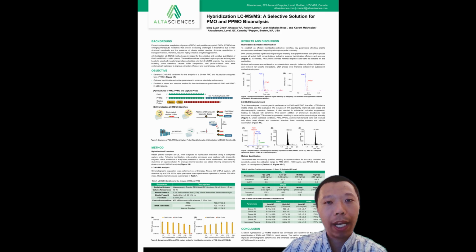PMO and the peptide-conjugated PMO, known as PPMO, are emerging therapeutic approaches. To support PK evaluation, sensitive and selective bioanalytical methods are essential. However, unlike conventional oligonucleotides, which are highly negatively charged, PMO is charge neutral, while PPMO contains a peptide conjugate that can introduce positive charges.